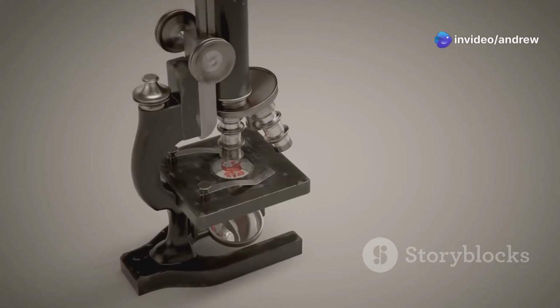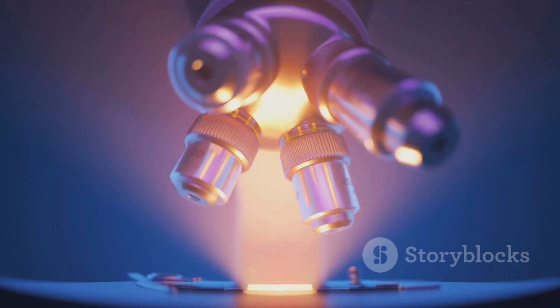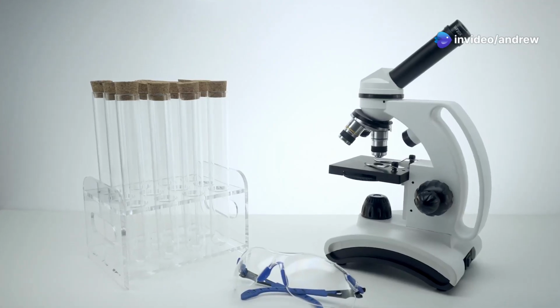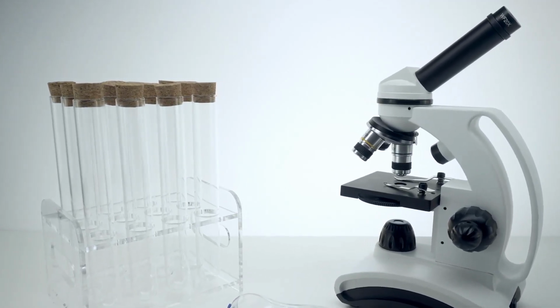In the early 20th century, a new type of microscope was invented, the electron microscope. Electron microscopes use a beam of electrons instead of light to illuminate objects. Because electrons have a much shorter wavelength than light, electron microscopes can achieve much higher magnifications than optical microscopes.